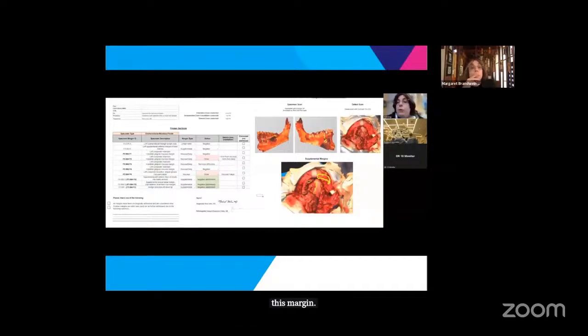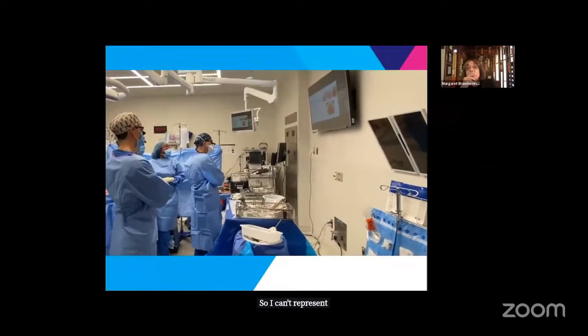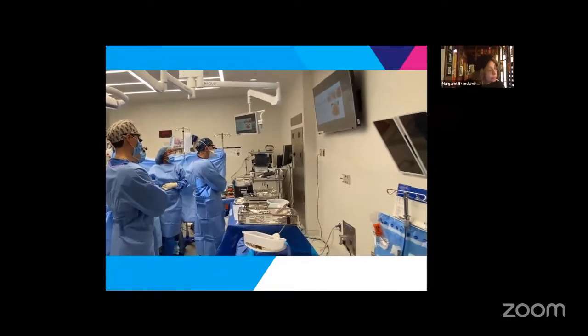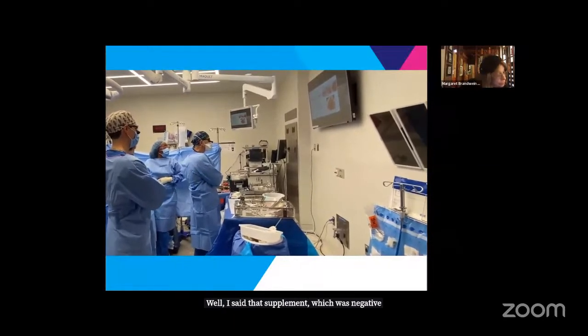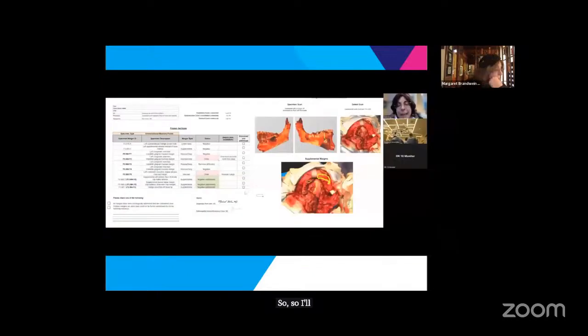And the wedge resection from the lip, where is that on these pictures, or is it not on these pictures? No, I can't represent it there, but it actually represents the ultimate deep margin of that buccal labial, where I sent that supplement, which was negative. So that should represent the final margin here. Right, so I'll have to take your word for that because I can't conceptualize that, but yes, that's negative.